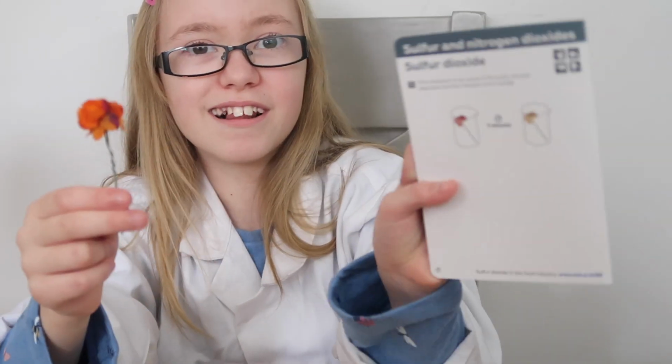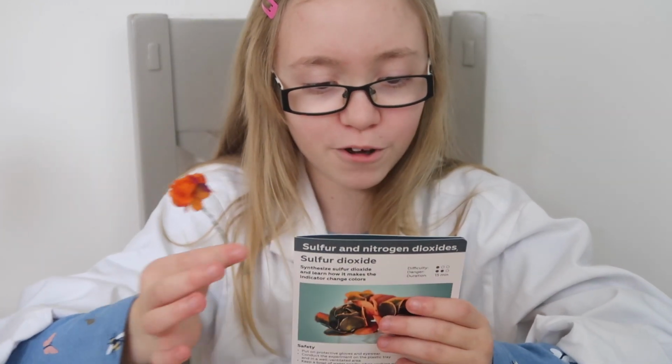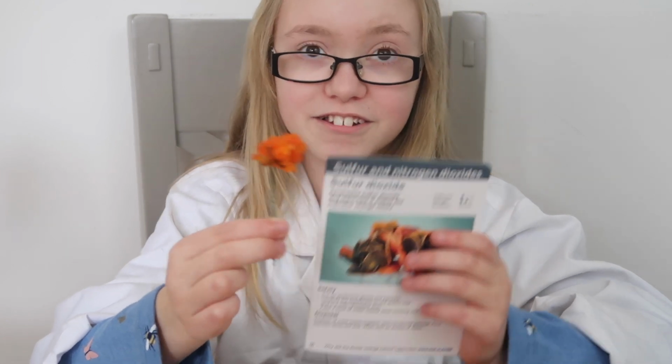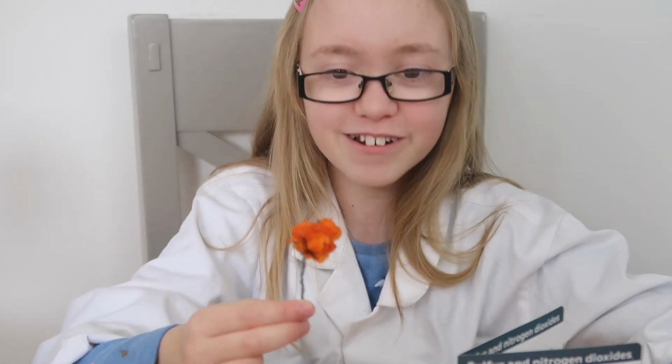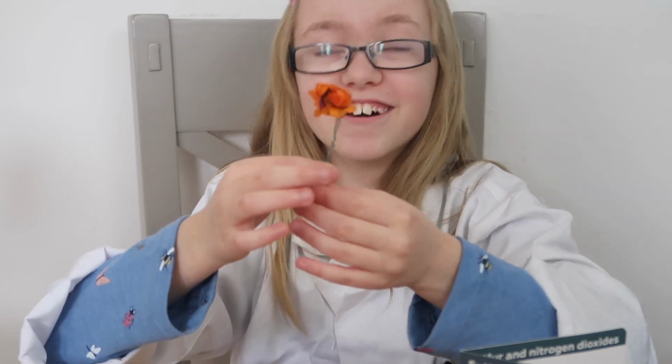Okay, I'm going to read the little end card, little back, and it says, with exposure to the air, some of the sulfur dioxide vaporizes and the indicator turns orange. So the blue solution turns orange again after being red, and as the sulfur dioxide vaporizes as a gas, the indicator turns orange.